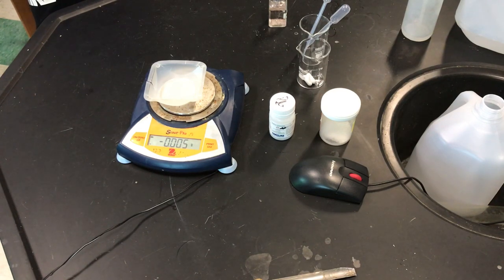So how much extra do you want to add? Because Le Chatelier's principle — we're going to add extra. What do you have there? I added 0.01. So you have 0.01 extra, giving a total of 0.01722 moles of hydroxide. That's a good choice — I would have done that too.